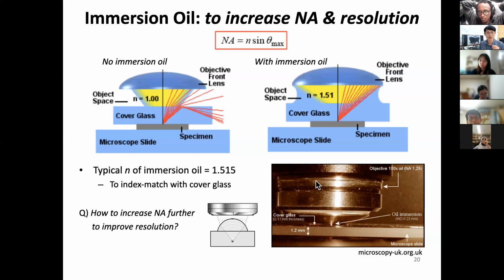On the side of your objective, you will find a WD, or working distance. In fact, this one has a WD of 0.23. What that means is only 230 micron is your working distance. Think about how small that is. It's less than a quarter of 1 millimeter.